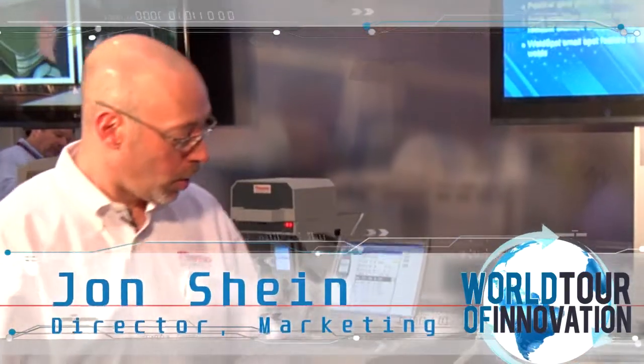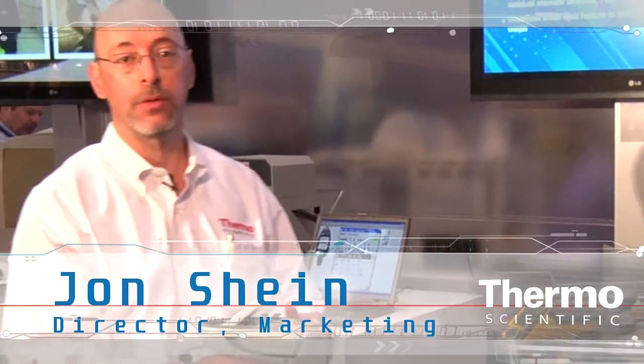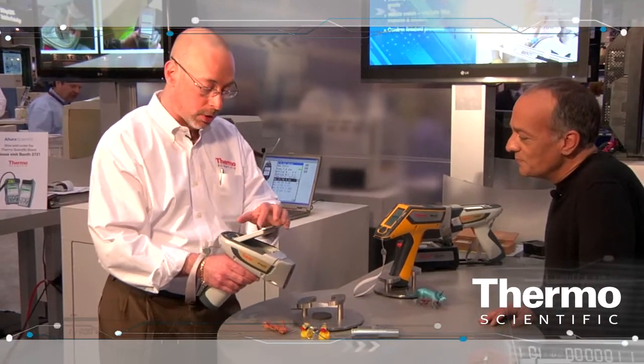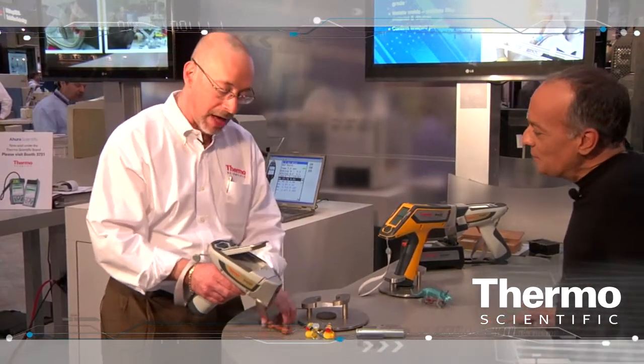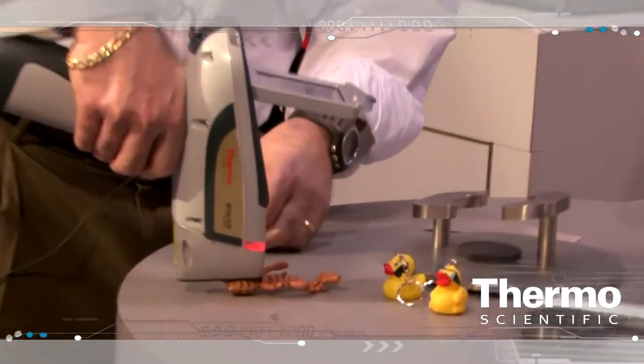Sure we do, Keith. What we have here is the instrument we introduced last year at PitCon — the Thermo Scientific Niton XL3 with Gold technology. What this does is it expands the performance capabilities of handheld XRF to places where it could never be done previously. What we'll do here is show a quick example of how the analyzer can be used to analyze toys or consumer goods for lead or other heavy metals.